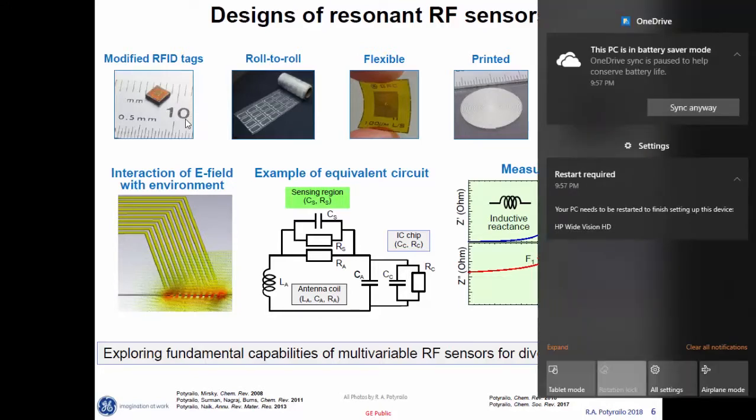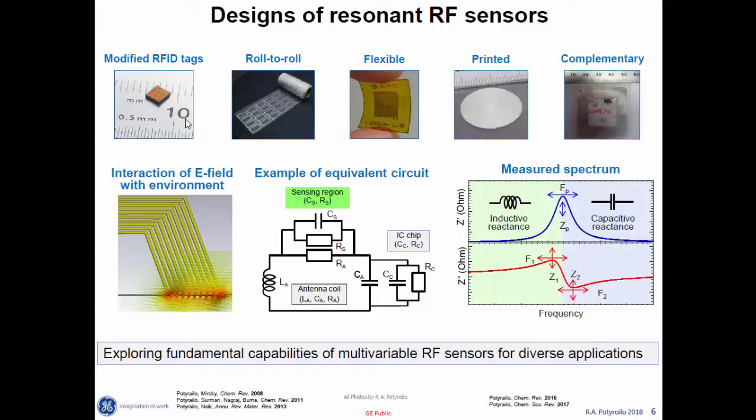Those features really boost the performance of our sensors in terms of being a multivariable sensor response. I will show you examples of how that boost is happening, but when we do the multivariate analysis of our sensor response, we are able to convert our multiple responses from that resonator into what I'm calling scores plots of our principal components analysis, as an example.